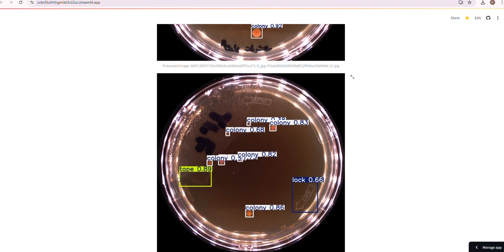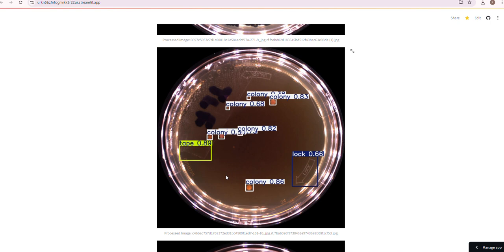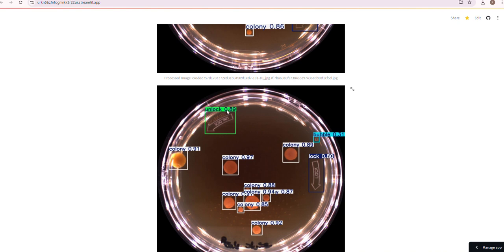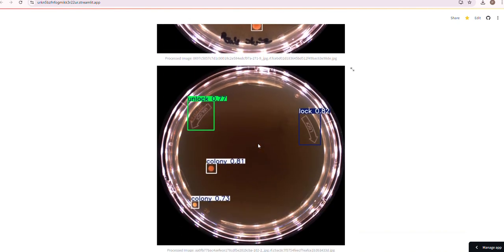And then you can see here, it's done some edge detection. It's looked at and it's seen that's tape. So it's classified that as tape. So we're able to detect some of these other features, which are not important to a bacterial colony count itself, but which could distort the image. The little number you see on the right, this 0.89, this is the probability that it knows what it's seeing. So 0.89, or 89% probability, that is in fact what the computer vision is looking at.